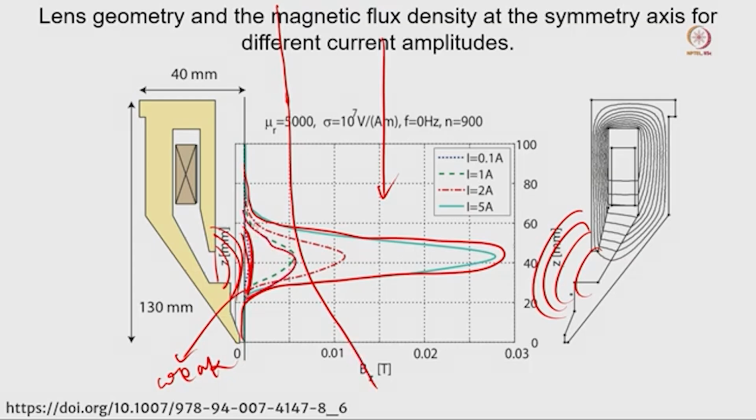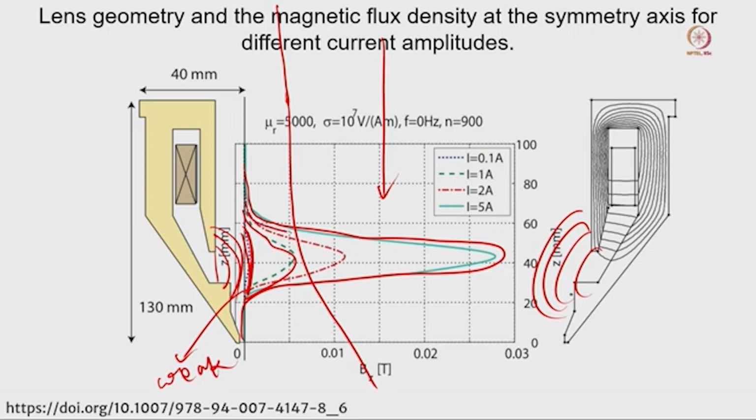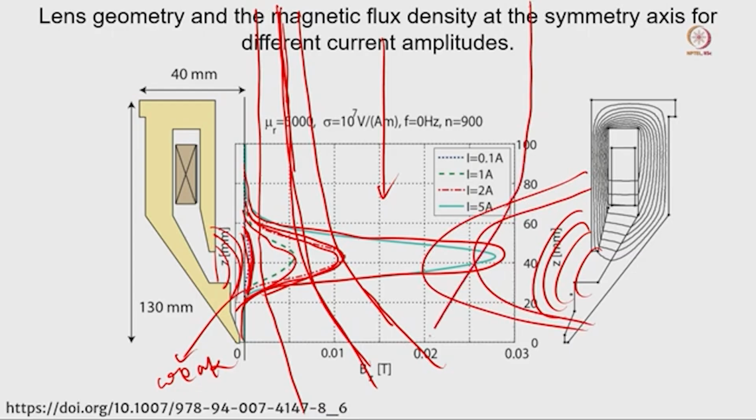But if we gradually increase the magnetic field, you can see that the deviation of the electron is going to change more and more. Initially, when the electrons are coming from this side, there is not too much magnetic field and the overall deviation will be less. But when we go to a very strong magnetic field, it is going to deviate the electron beams more. If you can follow this pathway, the same thing is possible in this lens also. Here one electron beam will come, the deviation will be much stronger and they will converge all the beams here. But in this particular case, when the magnetic field is very low, they will go all the way and converge at the bottom. The same thing is true for this one.